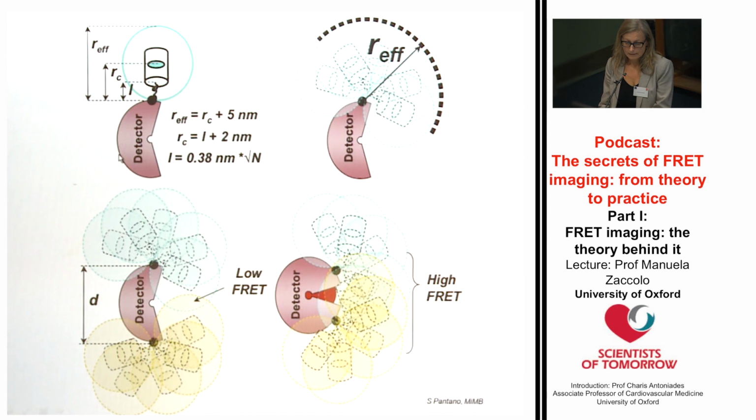And the other very important parameter, which is the position where the GFP can be fused, very often is not something that the experimenter can really change, because in most cases, the only viable sites are the amino terminus and the carboxy terminus of your detector domain, because any other site where you're trying to insert your GFPs may affect the ability of the detector to fold, or it may affect the ability of the detector to function as a detector.